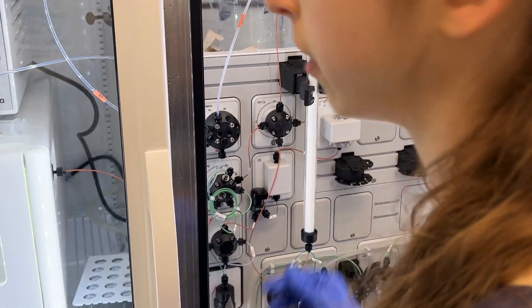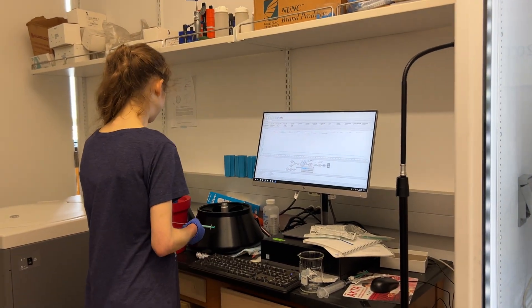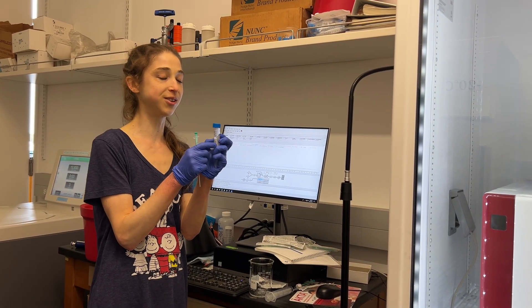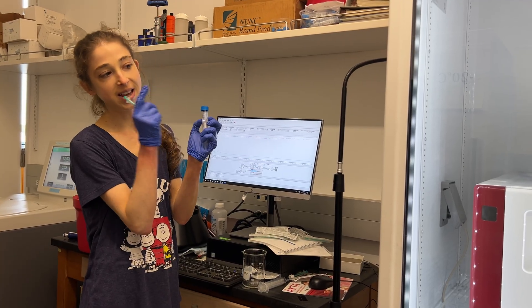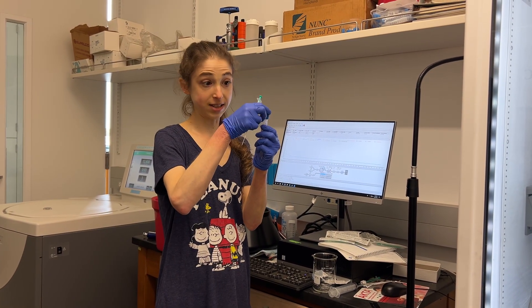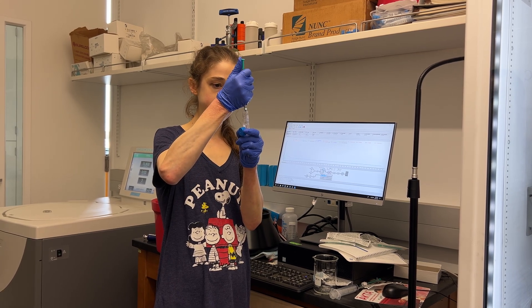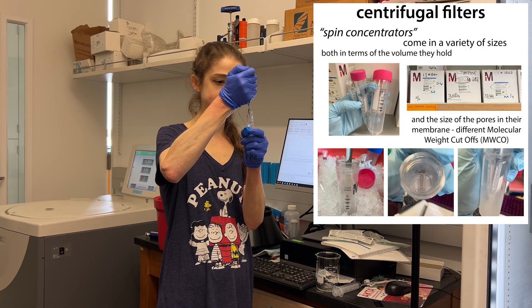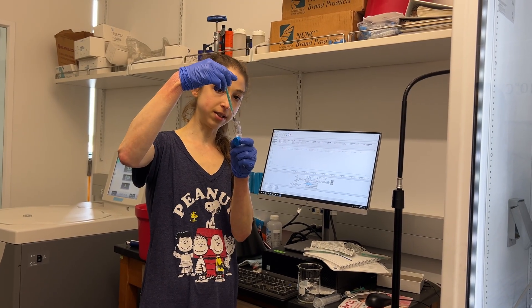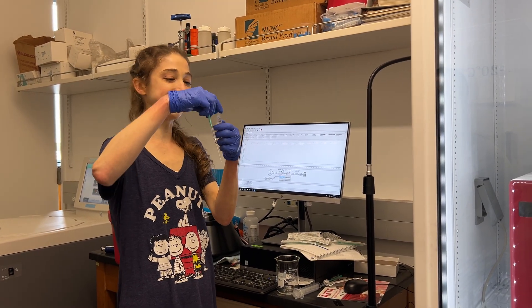Now the loop should be filled with buffer and it's time to fill it with our protein. We're just going to take it directly out of here, but we don't want to touch the membrane of the concentrator. It's really important that your protein is concentrated because it's not going to get stuck on the column in the loop — you want it to be as concentrated as possible to get the best resolution. I'm going to go up and down a couple of times to make sure it's mixed, then pull up a little over half a mil.